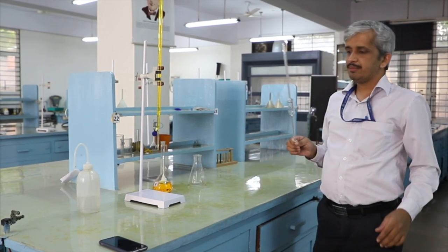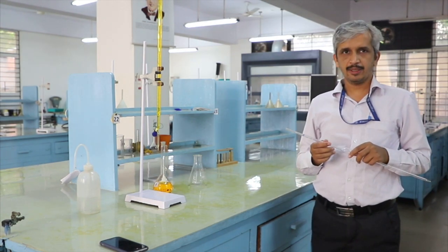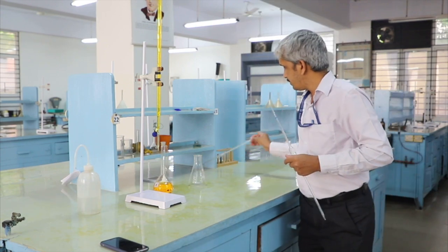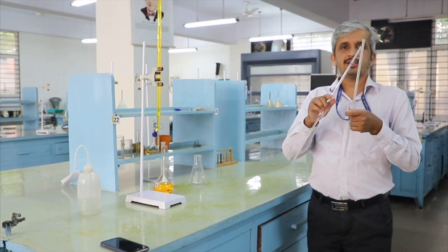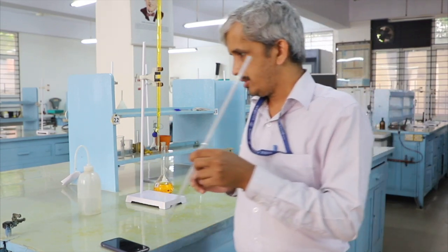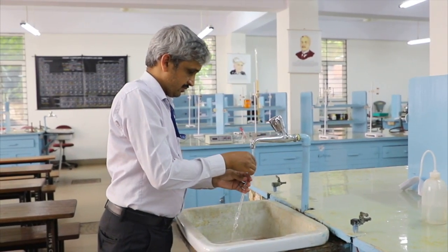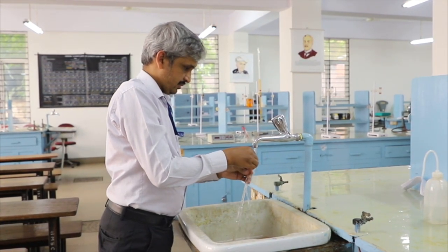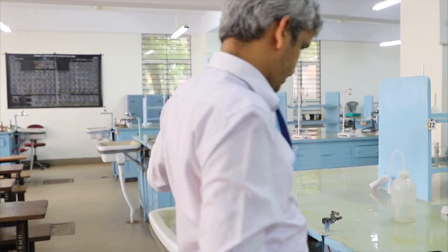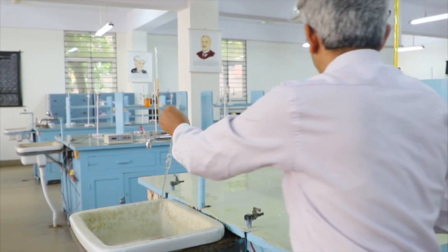And while using a pipette, the pipette first should be washed with tap water. I am going to demonstrate the 10 ml pipette. Exactly the same thing can be followed for a 25 ml pipette. So it can be washed in tap water like this, and should be rinsed with distilled water.